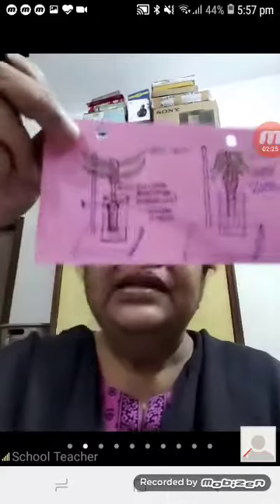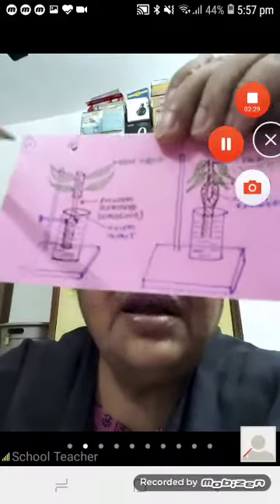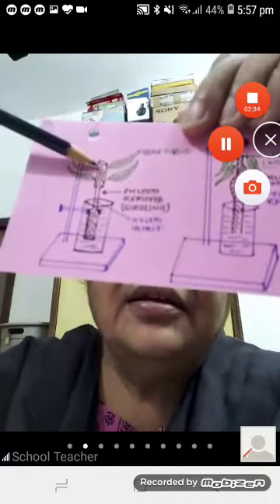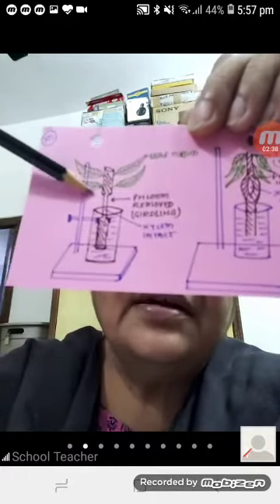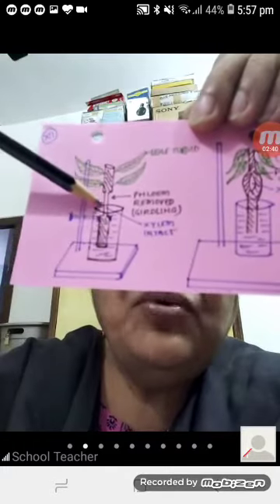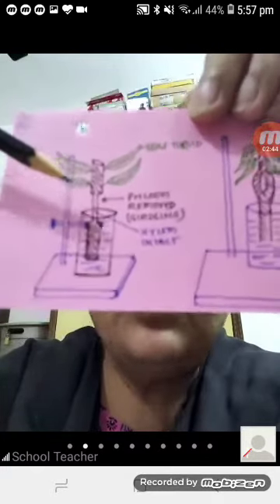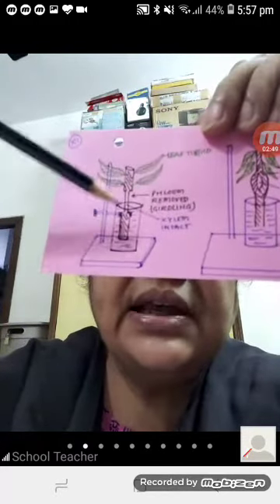This is another experiment to show that xylem conducts water. Here you have a stock with leaves from which the phloem has been removed. The removal of phloem is called girdling.